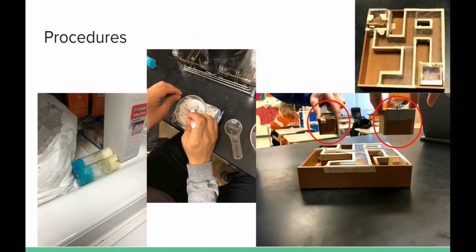The procedures for our experiment roughly follow these. Before any experimentation took place, we received our flies from Mr. Atkins, and we allowed time for reproduction before we prepared for our experiment. After 5 days, the vial of flies and pupa were placed in the freezer for 3 minutes to anesthetize. We examined the flies through a magnifying glass and split them into male and female populations. Each population was then split again to form 4 populations, 2 of each gender.